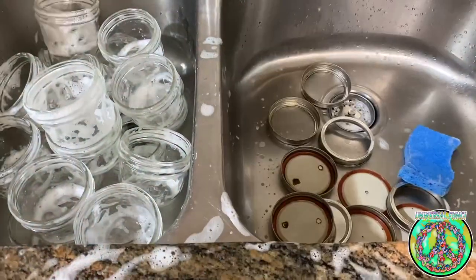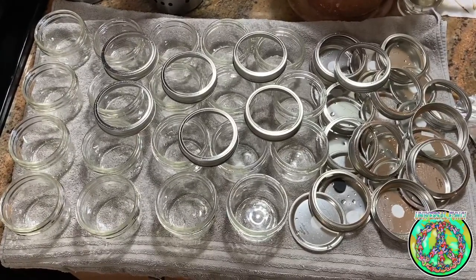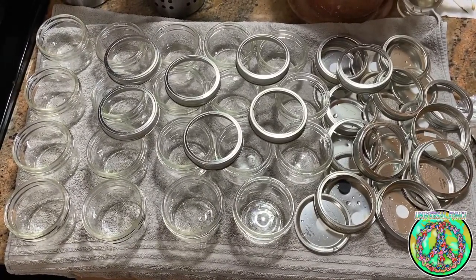So if you make a mistake, you can always start over. After washing all of the jars, I set them on a towel and allow them to air dry.